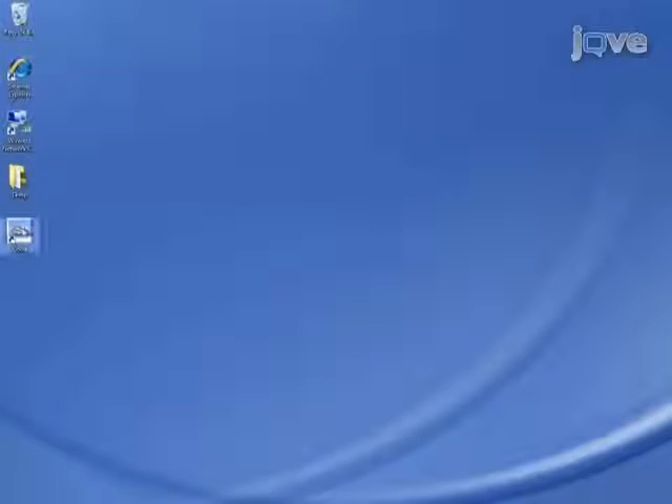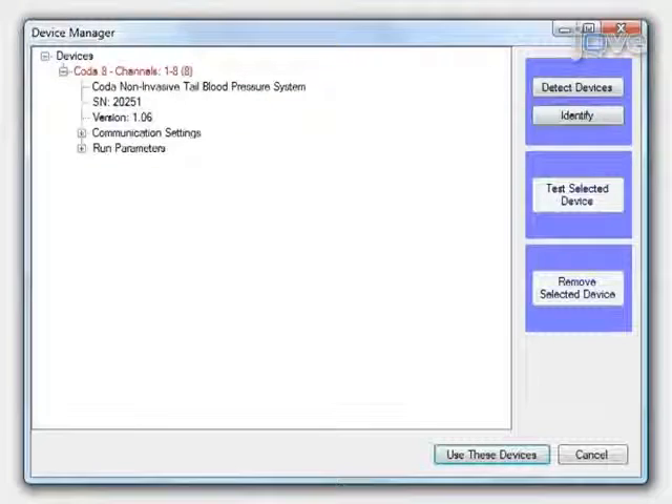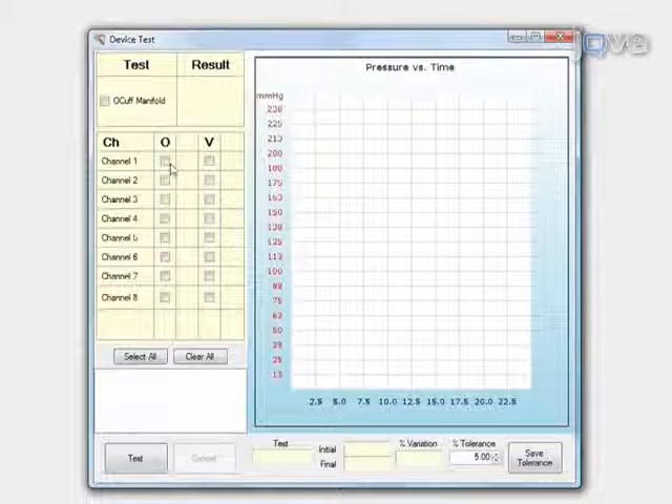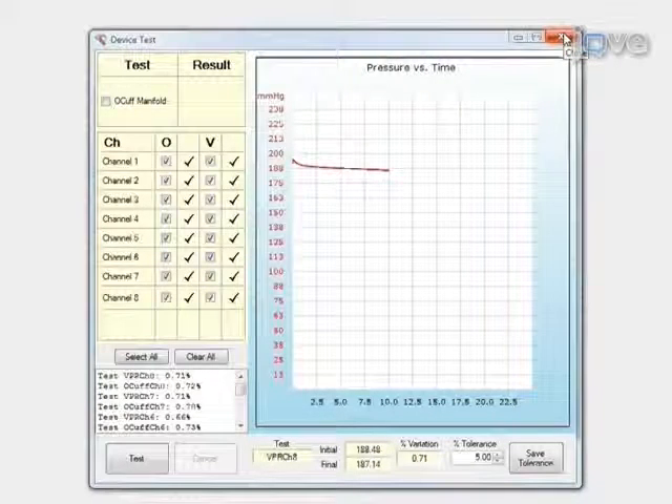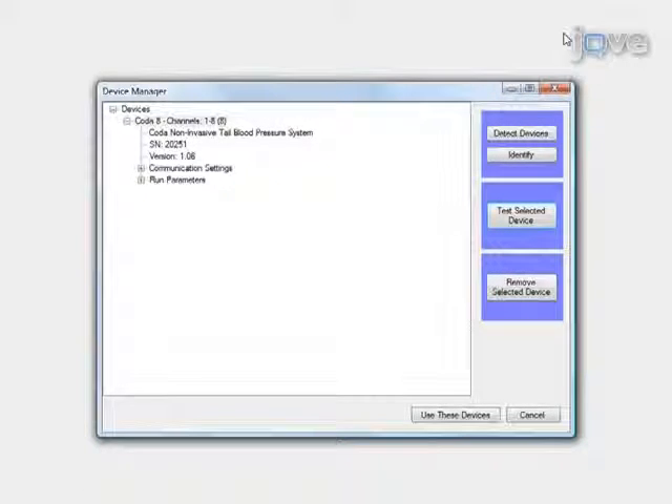Perform the controller diagnostics test. First, open the CODA software. Select the CODA device by clicking on it. Click on Test Selected Device. Select the cuffs and channels to test and click Test. After the controller diagnostics test is complete, close the Device Test window. Select the CODA controller to use, then click Use These Devices.